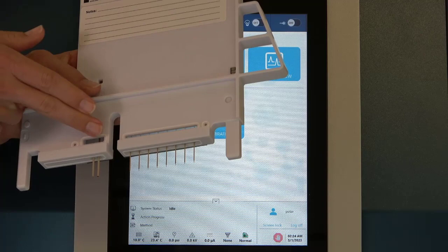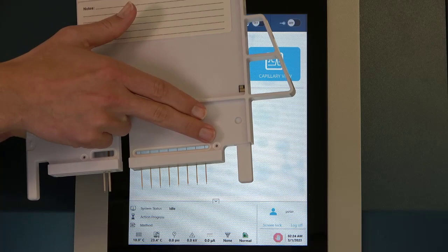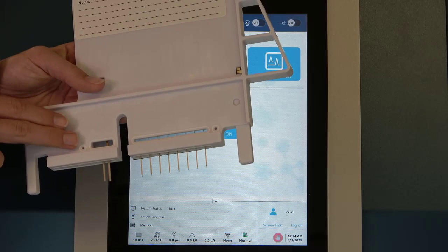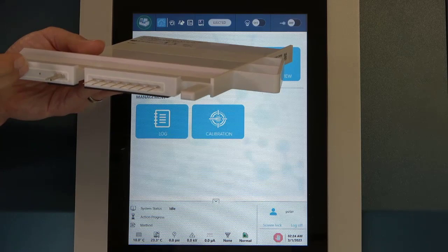If we flip this cartridge over, we'll notice a few things. The two O-rings or openings with O-rings are where our coolant is going to be circulating in and out of the cartridge. Pressure is also being applied here on the sides — a new design compared to our P100+ where pressure was applied to the bottom. Applying it to the sides allows for a lot less user involvement and a lot less cleaning of the instrument or the cartridge. I myself just take a Kim wipe, wipe down the O-rings that surround the capillary electrodes on the bottom, make sure those are clean, and then I'm ready to go.